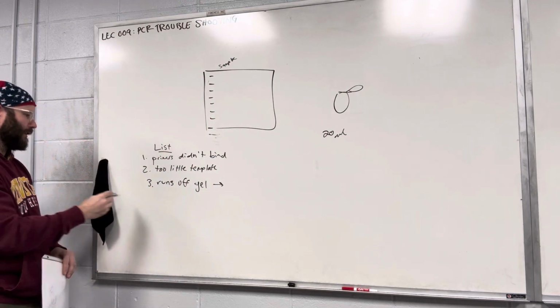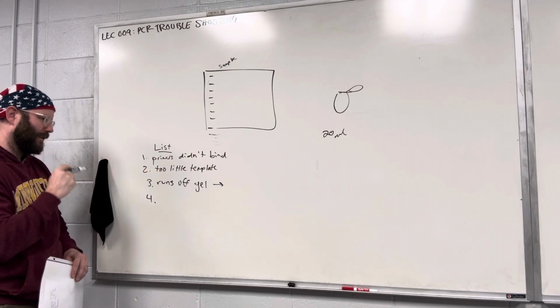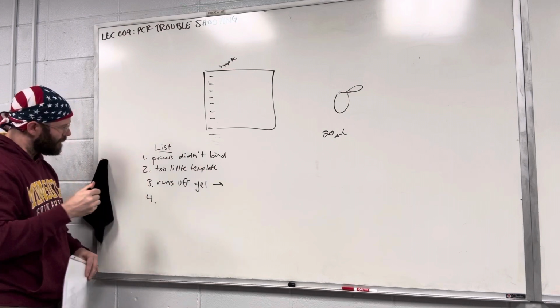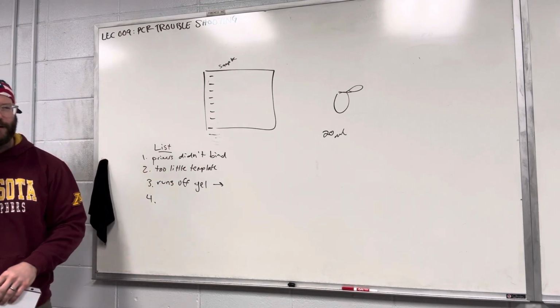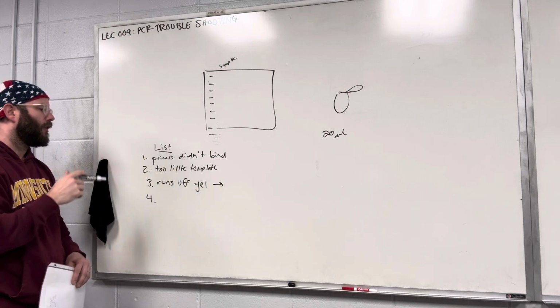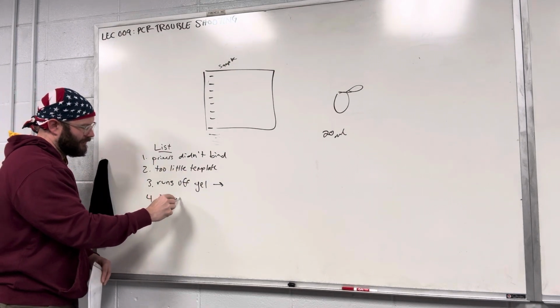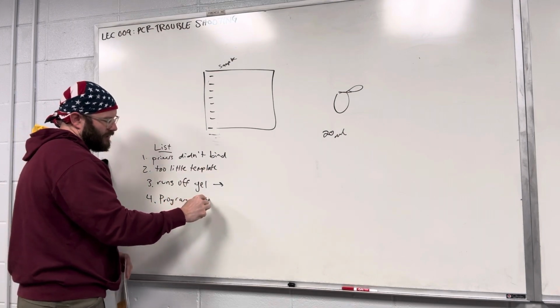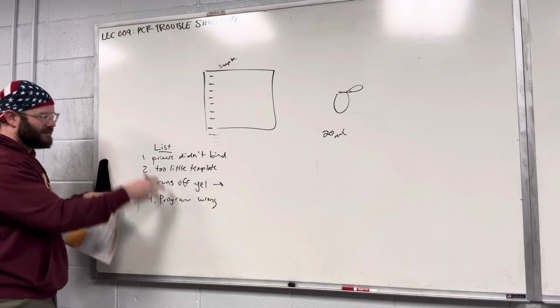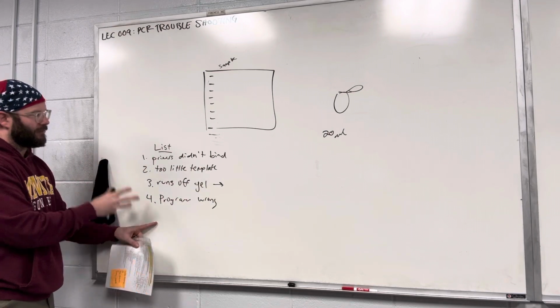What else can go wrong? You used the wrong thermocycler program? Like you didn't have the correct intervals and temperatures and stuff. Okay, so I'd call that your program is wrong. Yeah, that can happen a lot. So we understand these are some of the things that can go wrong. There's more. There's a lot of stuff that can go wrong.